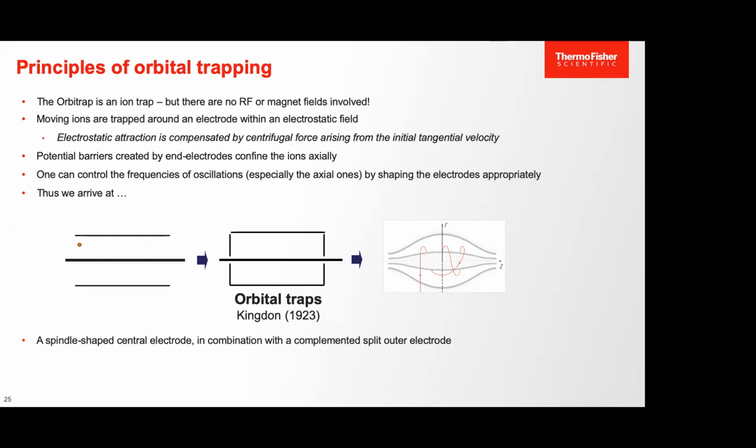You may have heard about ion trap, quadrupole, time of flight, magnetic sector. The newest technology, when we call it newest, was available 20 years ago, is called Orbitrap. After this session, tonight you can Google Orbitrap mass analyzer. Wikipedia will give you an explanation.